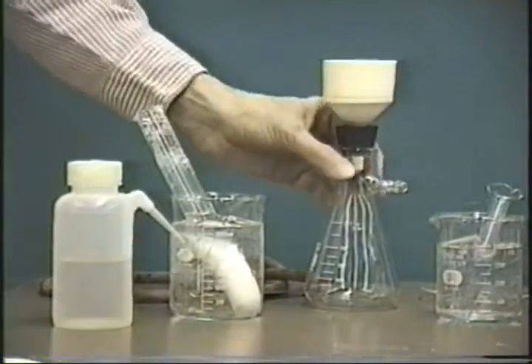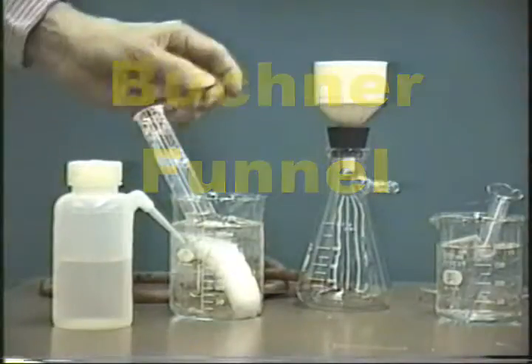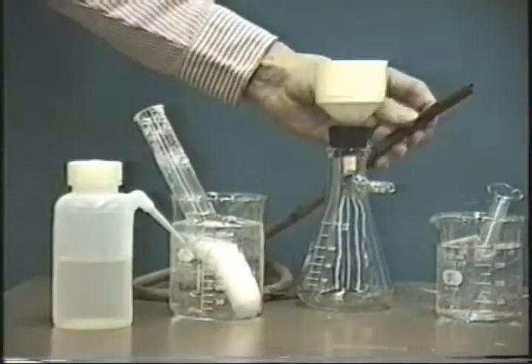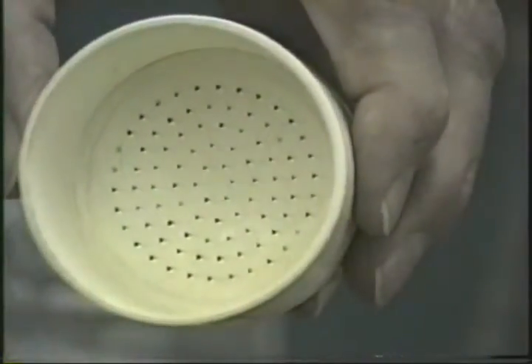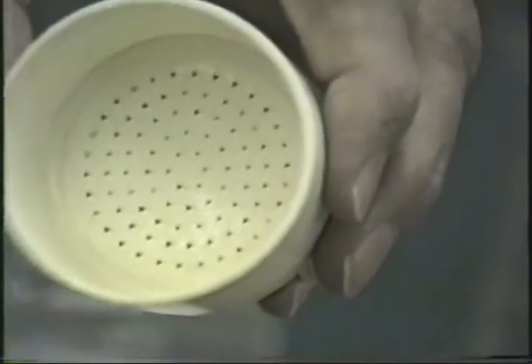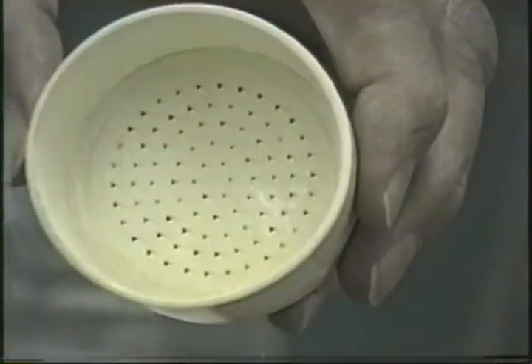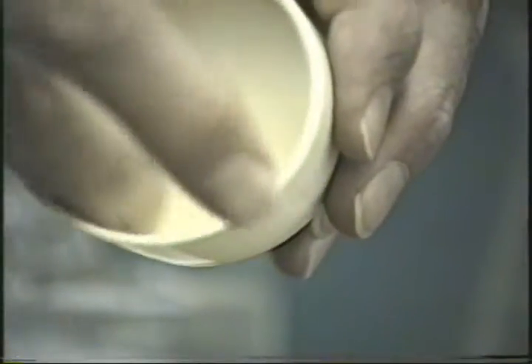To do this, we'll use a suction flask and a Buchner funnel. The sodium bicarbonate will be collected in the Buchner funnel using suction. The Buchner funnel has holes in the bottom to allow the liquid to go through. To prevent the solid from coming through, you must also use a piece of filter paper. This filter paper then is put right over those holes, and it must fit snugly in here.